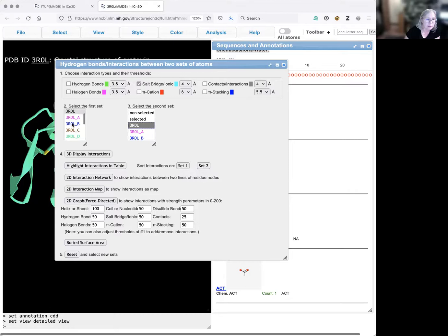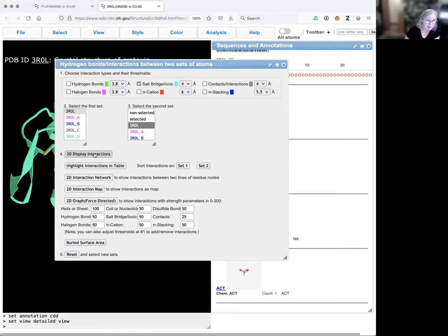If I wanted to look at interactions between specific chains, I could pick those instead. Now I'm going to click 3D display interactions.